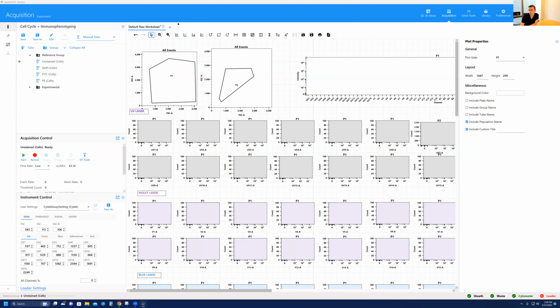So Kathy, actually, there's a question regarding the settings. I believe in the acquisition control, someone is asking, you adjusted it to 3,000 microliters. Should we change to lower volume? Can you explain there? Yes, that's a great question.